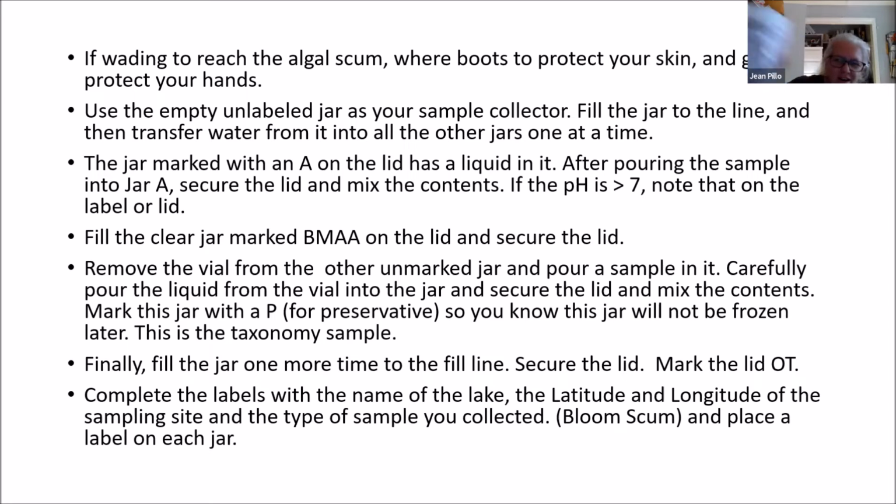Okay, this jar, can you hear that? There's a little vial inside there, a little glass bottle, and it's got a liquid in it. This jar has to be treated different from the other jars because 3 of the jars are going to get frozen. This one's not. But I don't like that they didn't write on the lid, because this jar also has nothing written on the lid. And I don't know that they have the hole in the top of the jar.